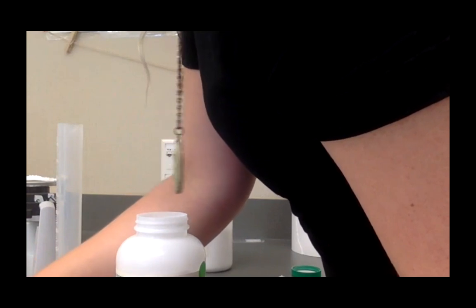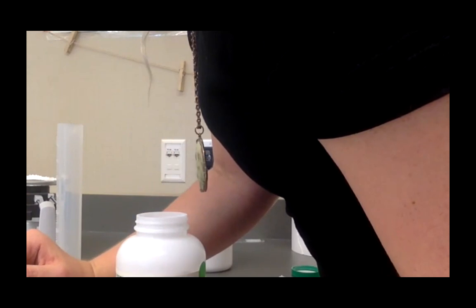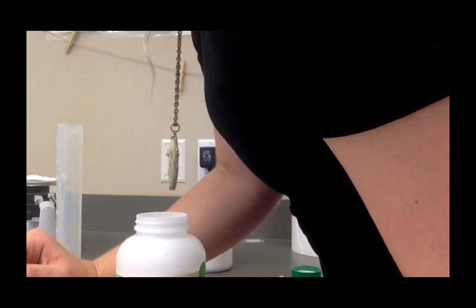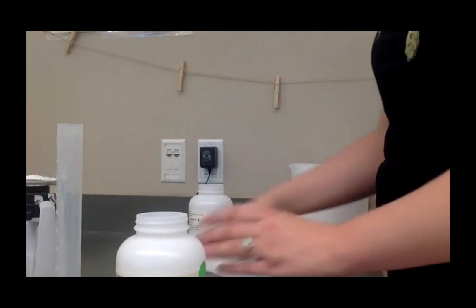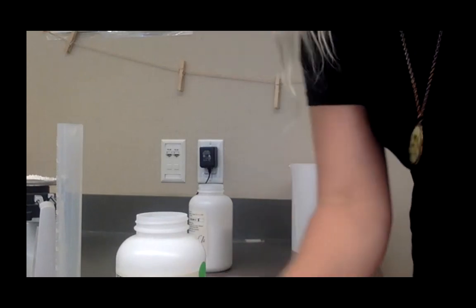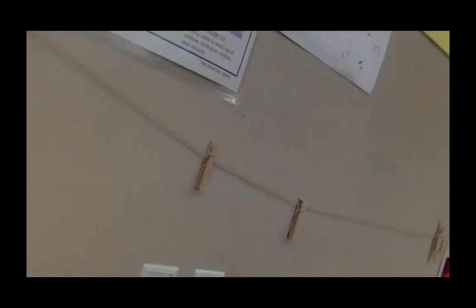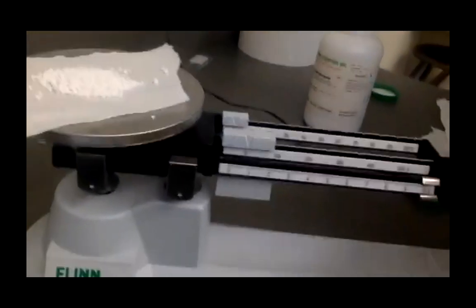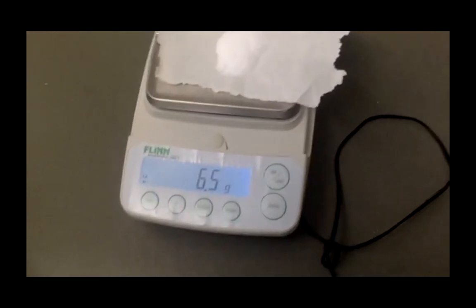Okay. Wow, the digital scale is giving me issues. Okay, so we are recording our masses. We just found out that our mass of calcium chloride is a little over 10. Let's see if we can show this. Beautiful triple beam balance. Okay. And then our glucose mass is 6.5.